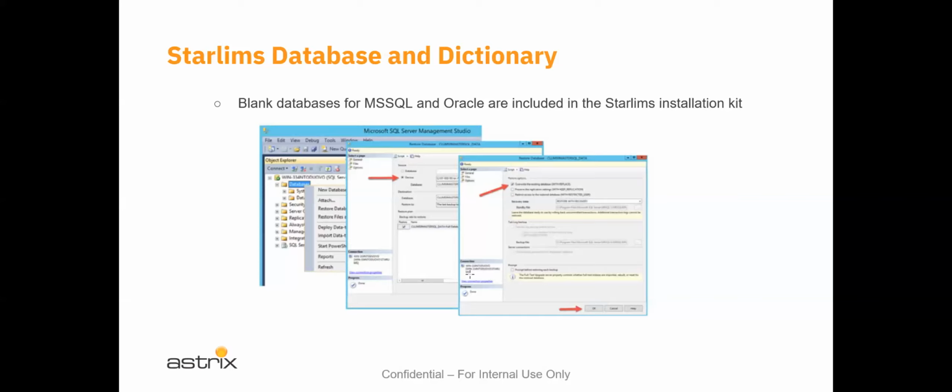So they have a STARLIMS system on top of which sits, for example, a forensics laboratory vertical, or a pharmaceutical vertical, or clinical science, or studies. These are all functionalities that have been built on top of the toolbox STARLIMS. So there's a clear distinction between what STARLIMS is and what it does.